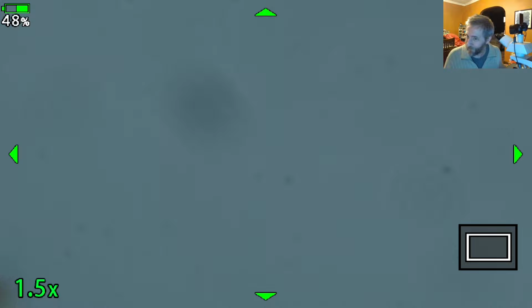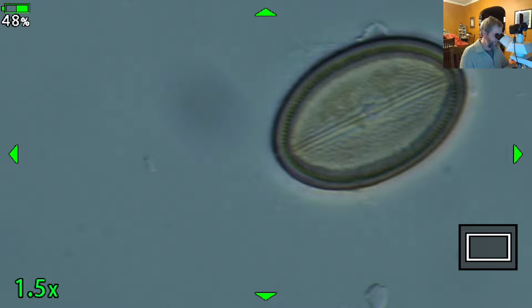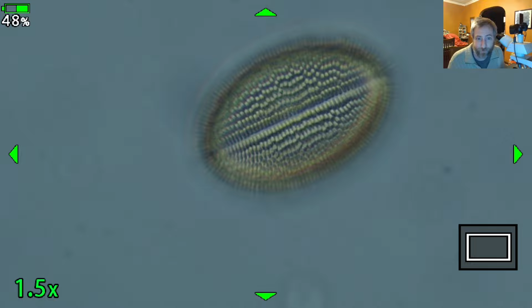Let's see. So is that semicircular thing? Oh, sorry. I can't keep up with it. There are some things on here that aren't diatoms because the sample was digested, but like this thing, this one's a circle. That's a diatom. This one's actually a diatom called Cocconeis. And I mentioned before the big raiding party came in, Cocconeis are what are called monoraphid diatoms.